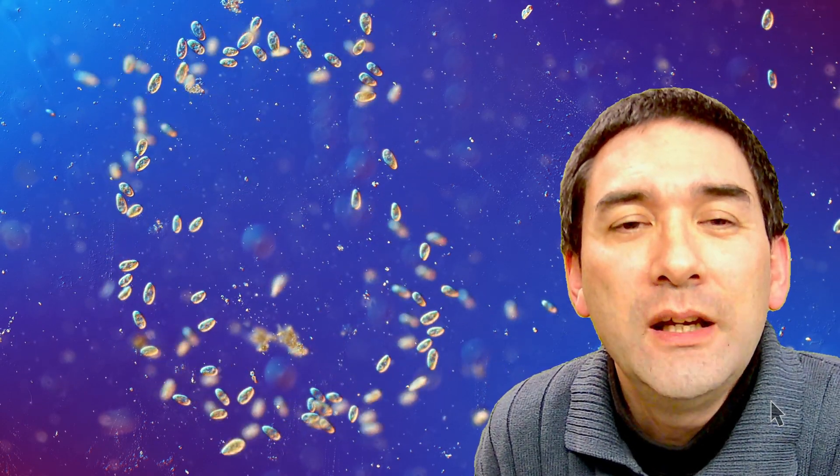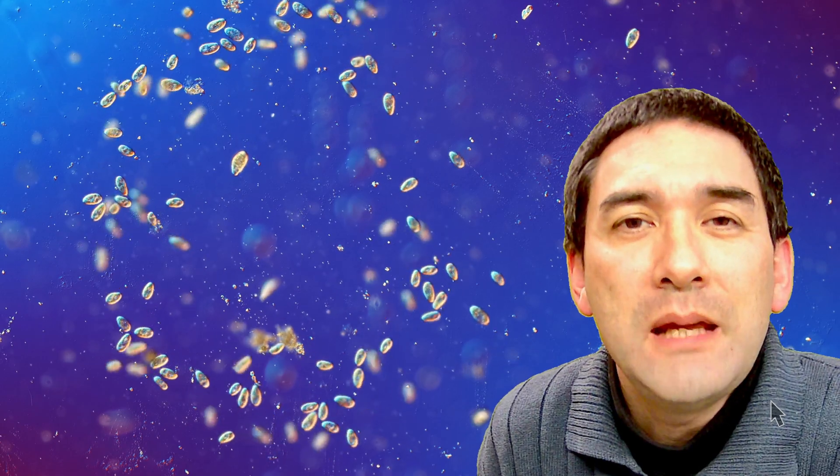Here again, they're making an interesting ring-shaped orientation here. I don't know why they made this pattern, but apparently they are going around in a circle because maybe it has to do something with the level of oxygen concentration.